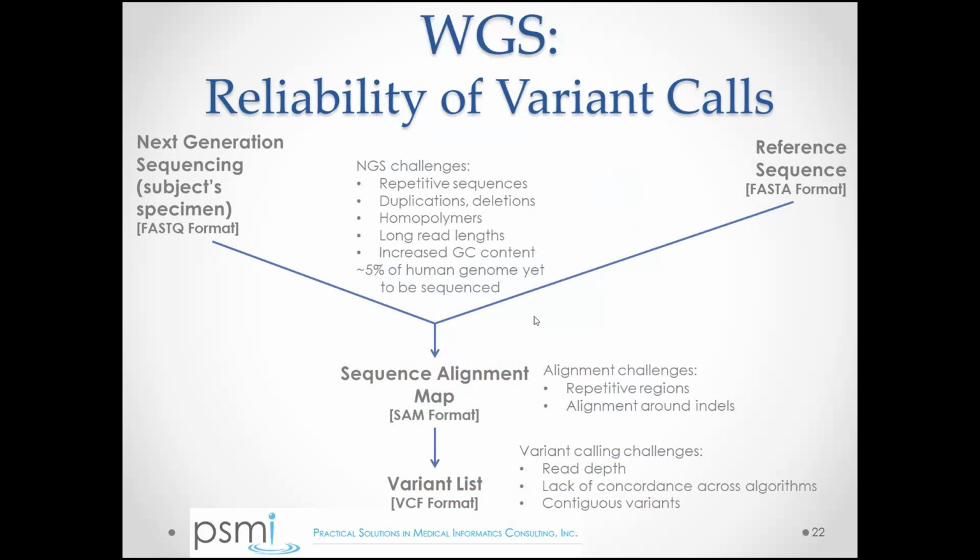And here I think, from a clinical perspective, it helps to get a warm, fuzzy, qualitative understanding of the reliability of variant calls. It's difficult to give a quantitative assessment because it's very machine dependent, and the actual accuracy of a specific variant call depends on a lot of different factors, not just the reliability of a particular base call, but also the read depth.